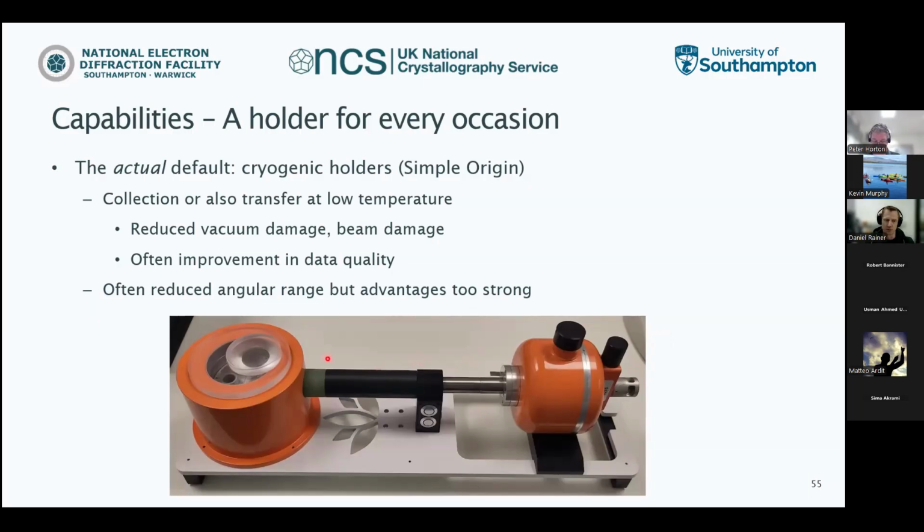Now we can also fill this front part here with liquid nitrogen before. So we mount the sample, we mount the grids, and then fill this part and this part with liquid nitrogen, and therefore already have reduced the temperature, hopefully enough, so that when the grid is exposed to the vacuum in the instrument, and for example it's a solvate, there's some water bound to the material, the water is not removed due to the vacuum, and we can perform a measurement.